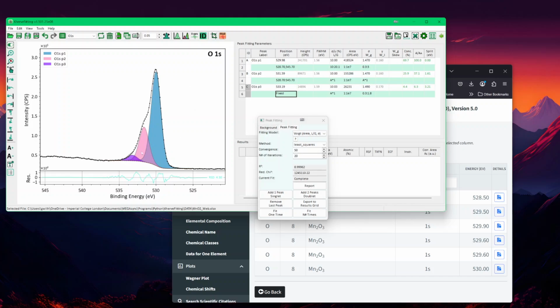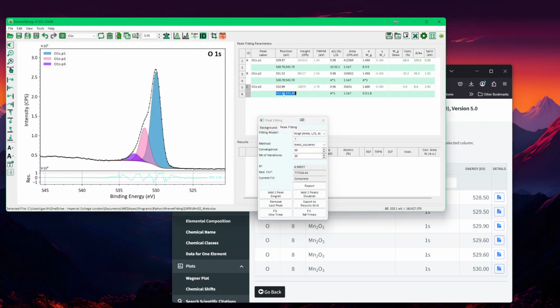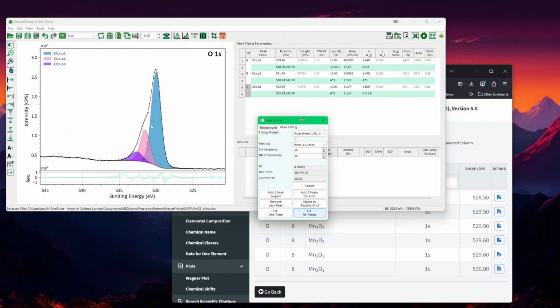So that's actually not too good. I'll give a different position, maybe plus minus 0.3, let it vary a tiny bit. Maybe it's still going to the maximum, to the minimum, and maybe 0.3 again. So it's varying and varying. Maybe that's something that looks quite good.